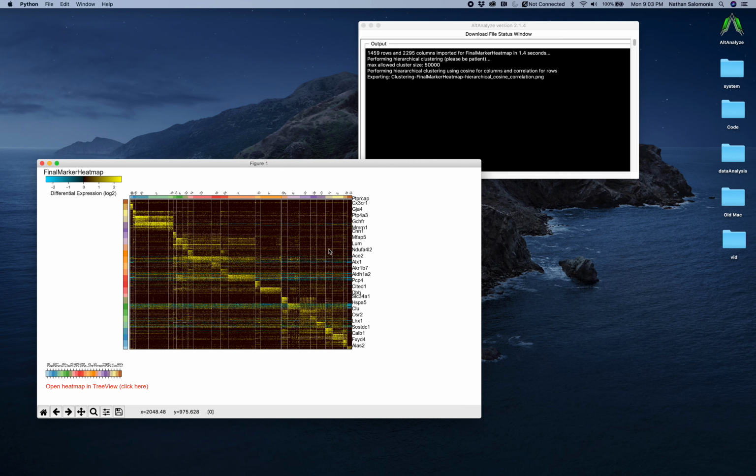Each row is a separate gene, as I mentioned before. Each color here indicates a different gene cluster. Each column here on the top is a cell with each indicated cell cluster. The white lines in between the clusters demarcate the individual separate clusters. Over here on the right is the first gene listed in each cluster. For space, it automatically does this if there's indicated clusters. And you can always click on any of these genes to get additional information.